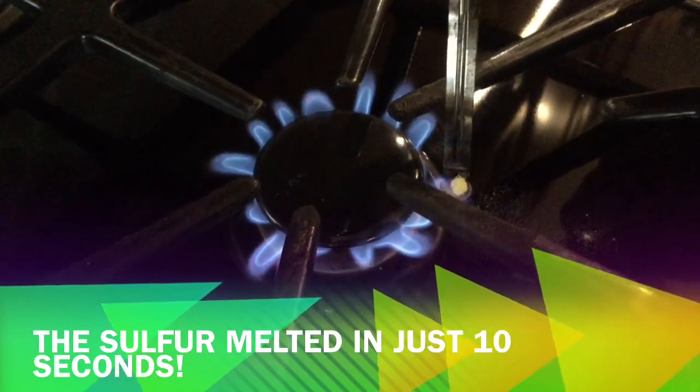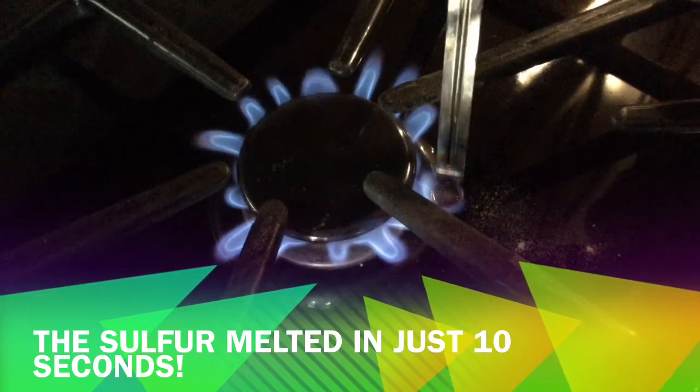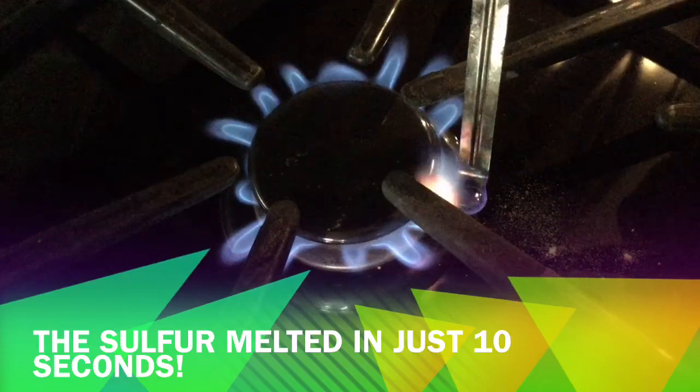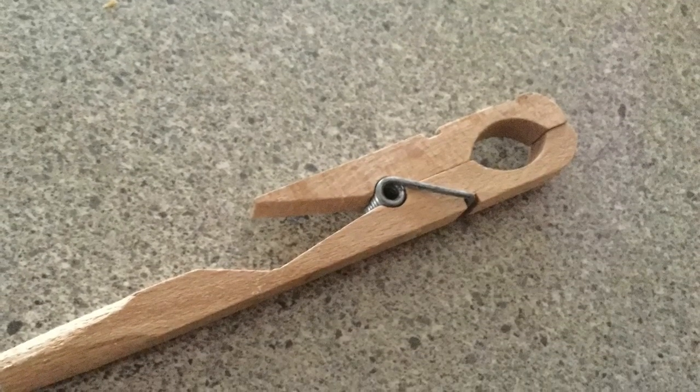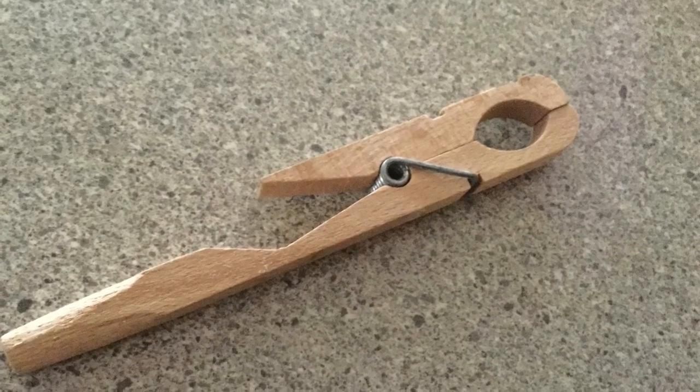After that, I heated the sulfur over an open flame — that's why I bent the spoon. As you can see, sulfur burns a bright blue. If the measuring spoon becomes too hot to handle, clamp it on a test tube holder that is made out of wood, as shown here.